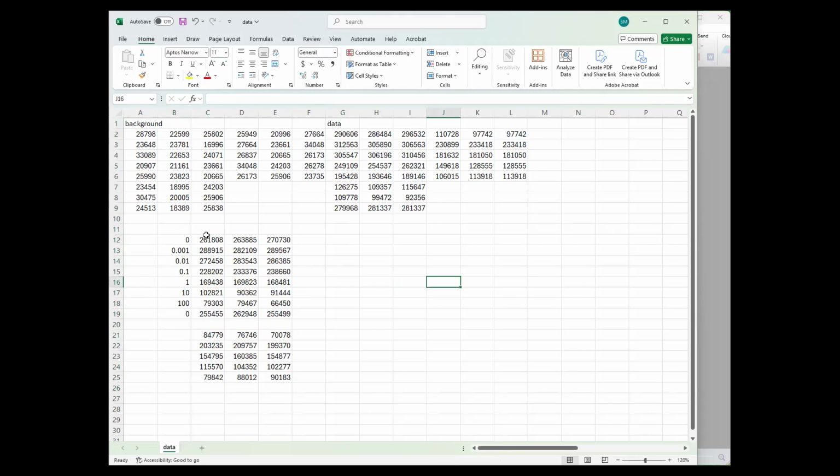And I put these on the edges because sometimes plates can have edge effects and you don't necessarily want your good data, especially your standard curve, to be along the edges. And the zeros don't really matter that much, and you'll see why in just a second. Because essentially all of the binding sites are taken up by the fluorophore. So this concentration here at 0.001 micrograms per mil of brevetoxin is essentially 0 if you're considering it in terms of the receptor binding assay.